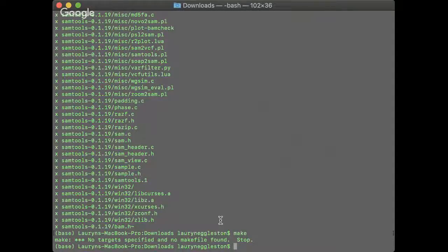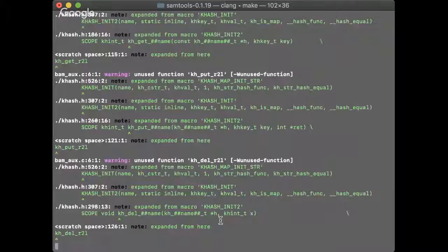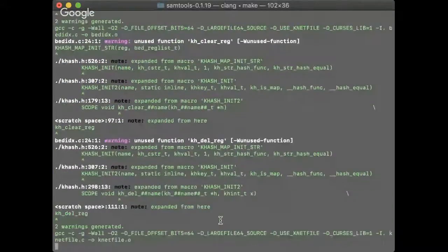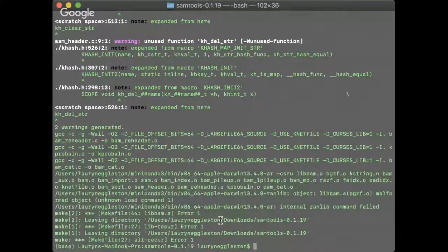Oh, that's because I didn't. Okay, had a couple errors, but I think it's still going to be okay.